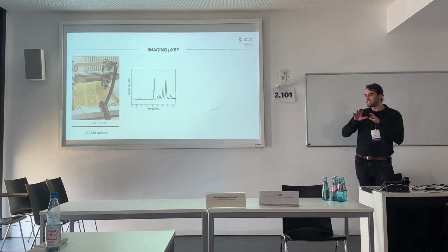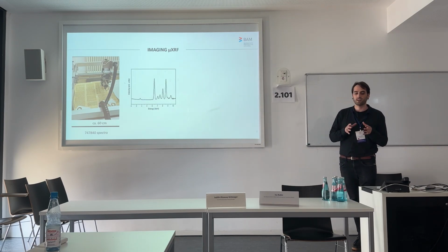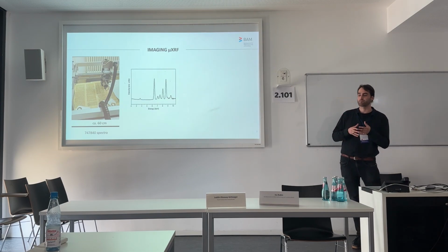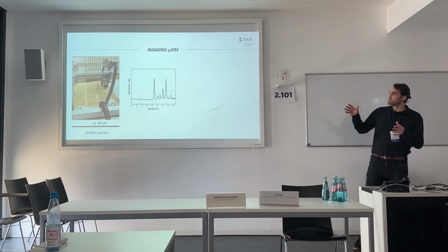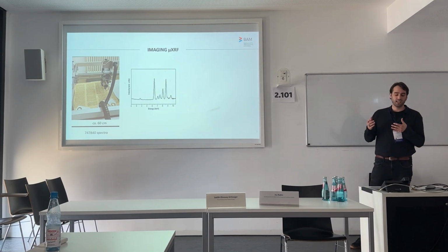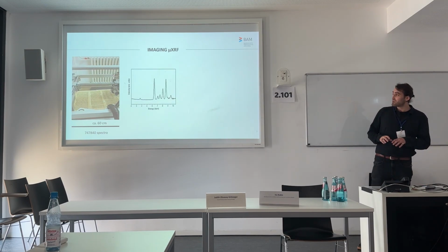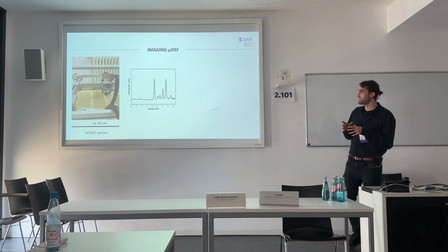You already received a little introduction to the µXRF technique, which gives us information about the elemental makeup of the material which we are studying. In principle, with µXRF, we collect a spectrum, and in the spectrum, the energy informs us about the elements which are present, and the intensity of the signal gives us an idea about the abundance of the elements present in the sample.